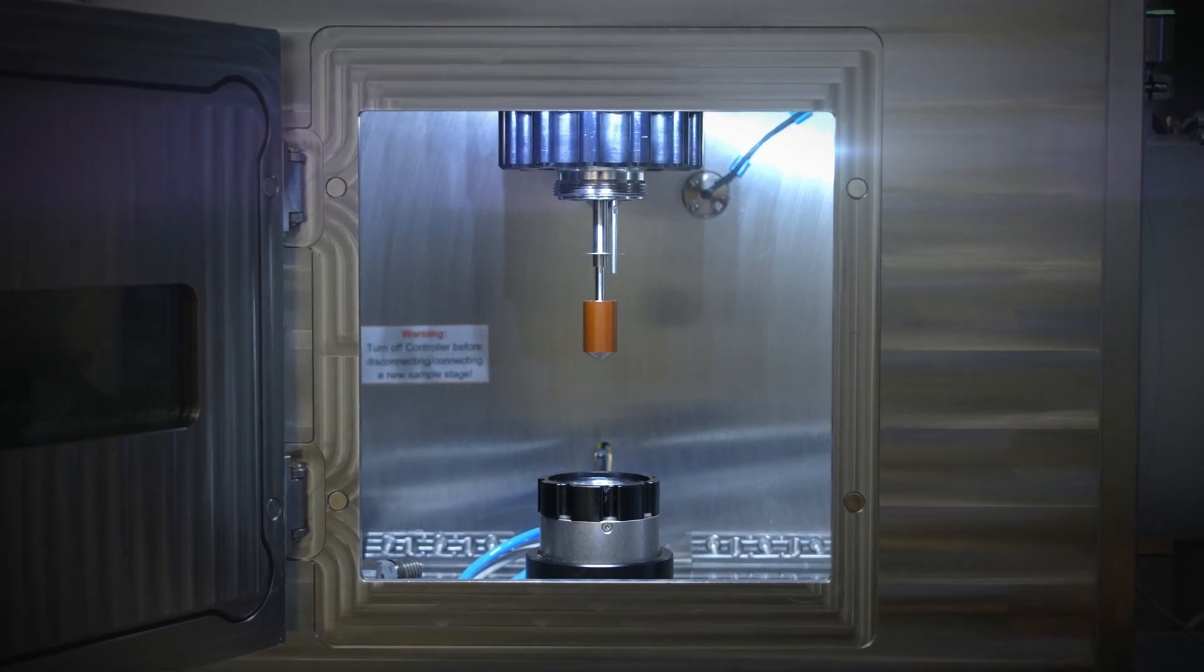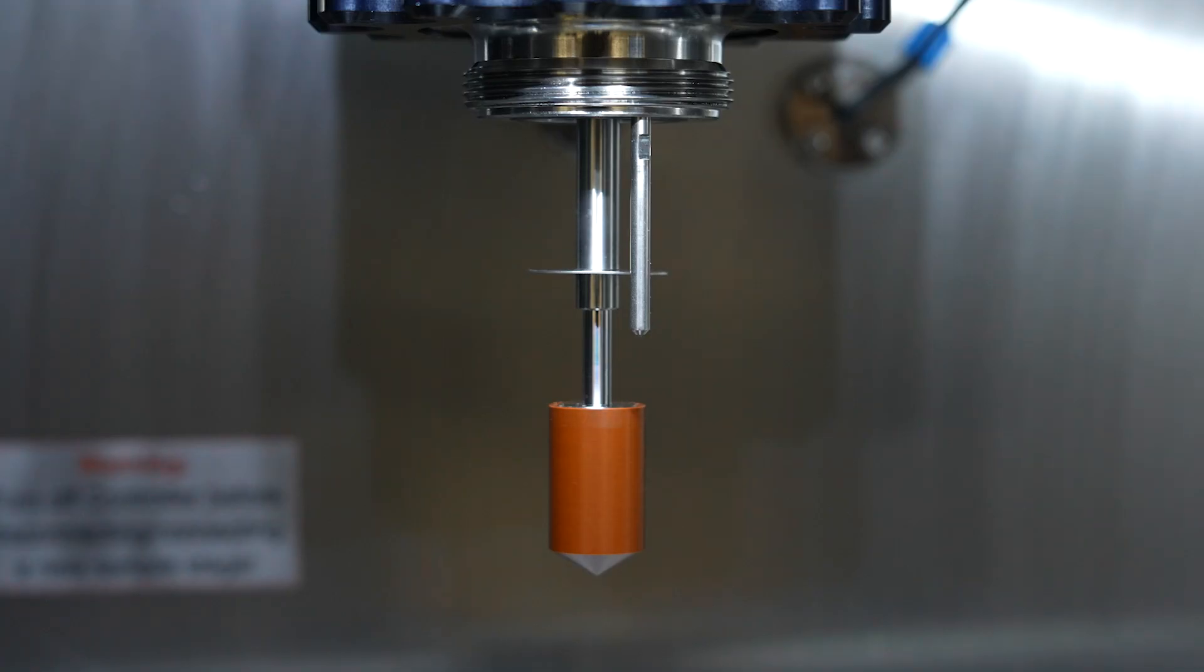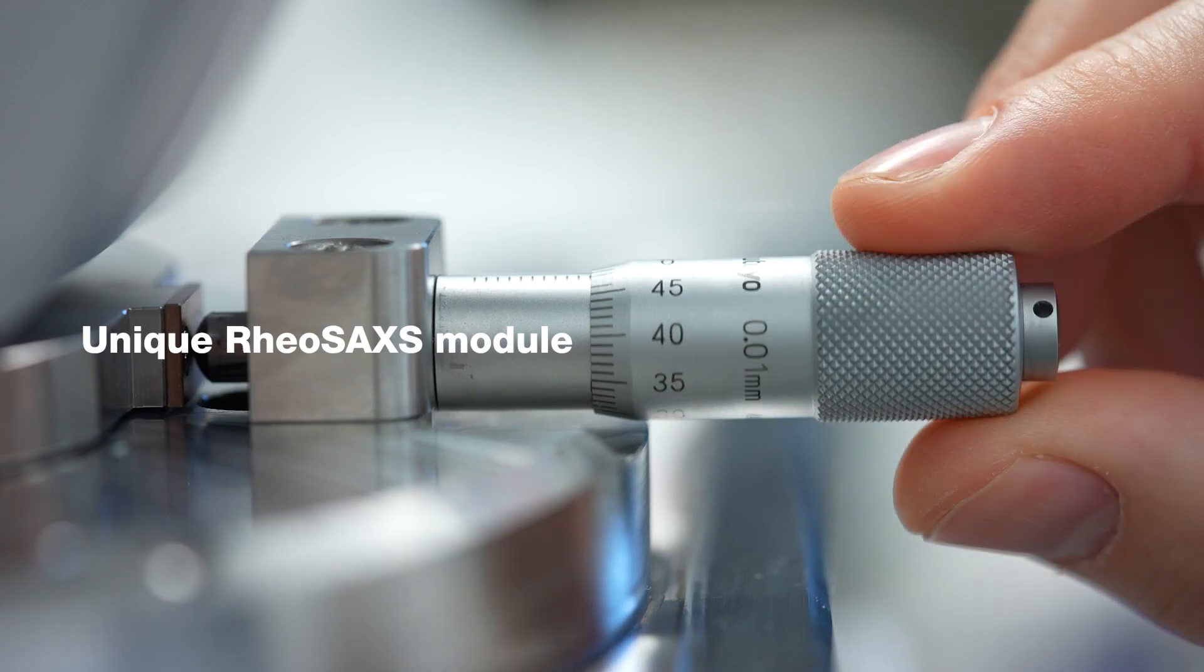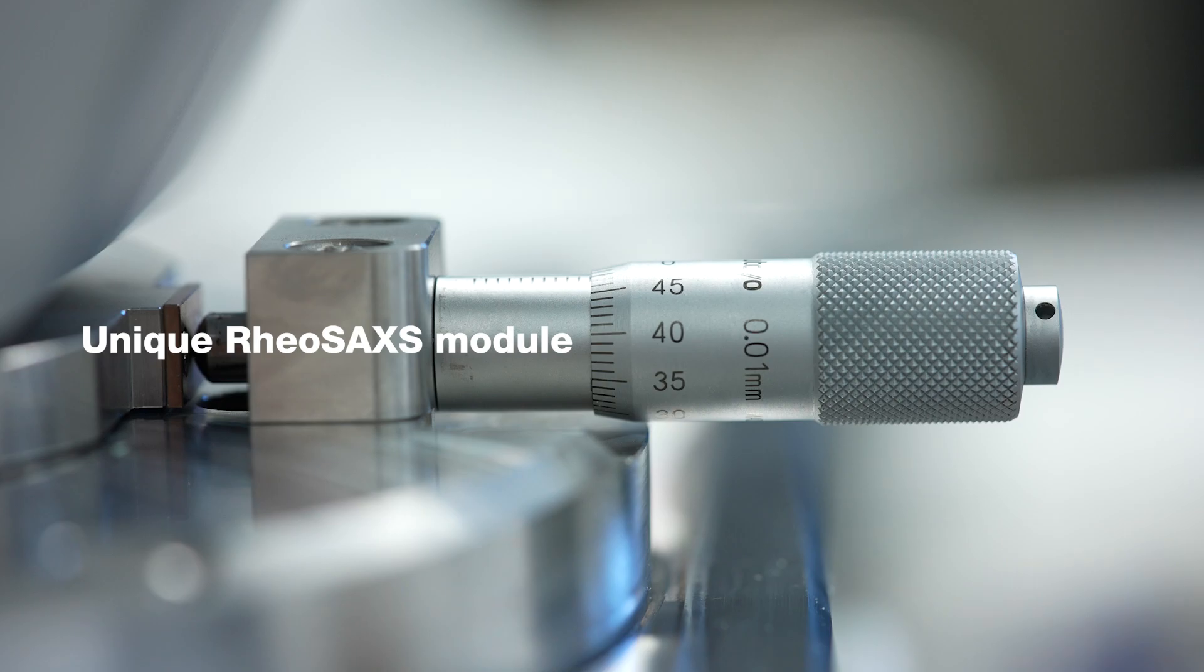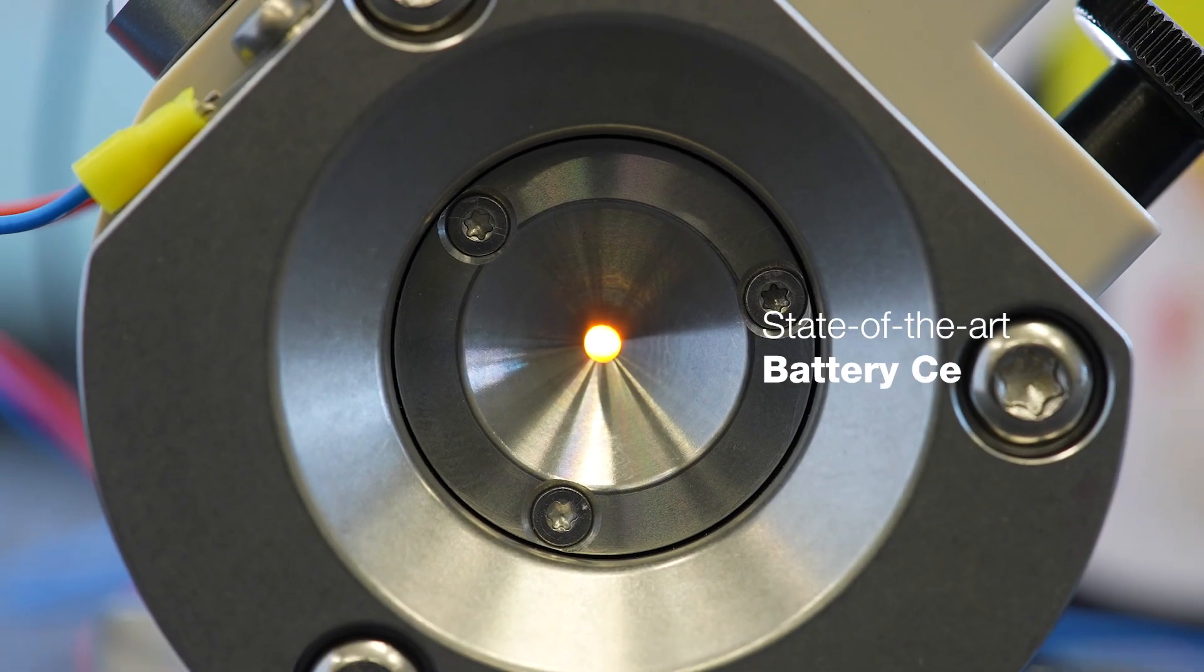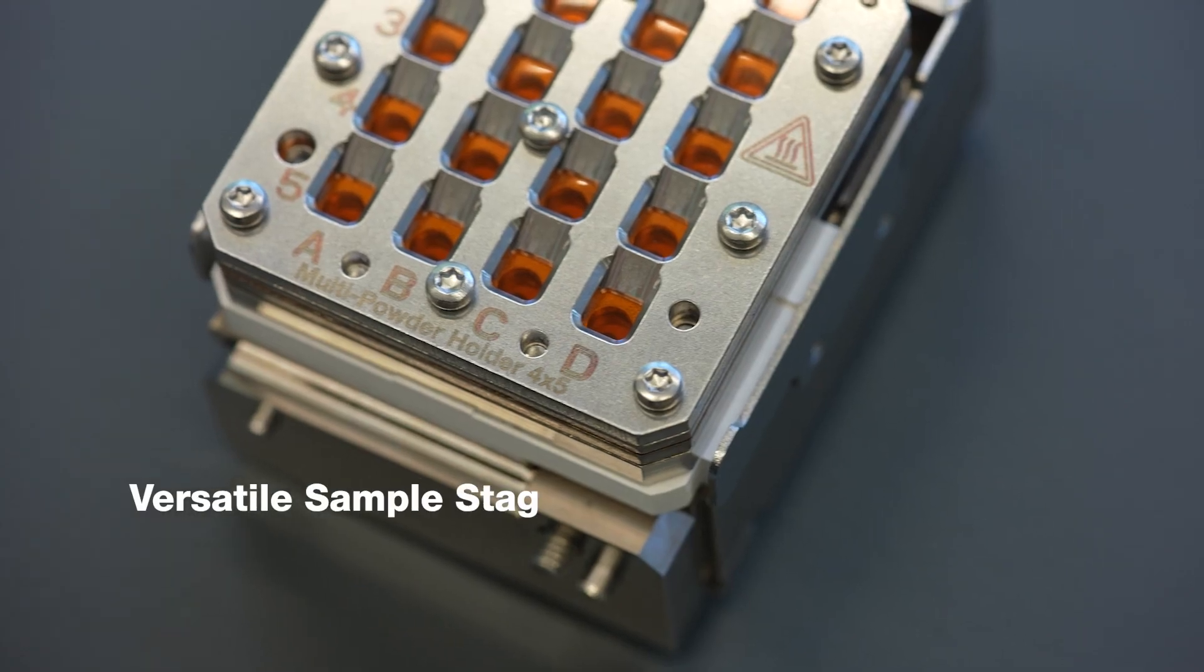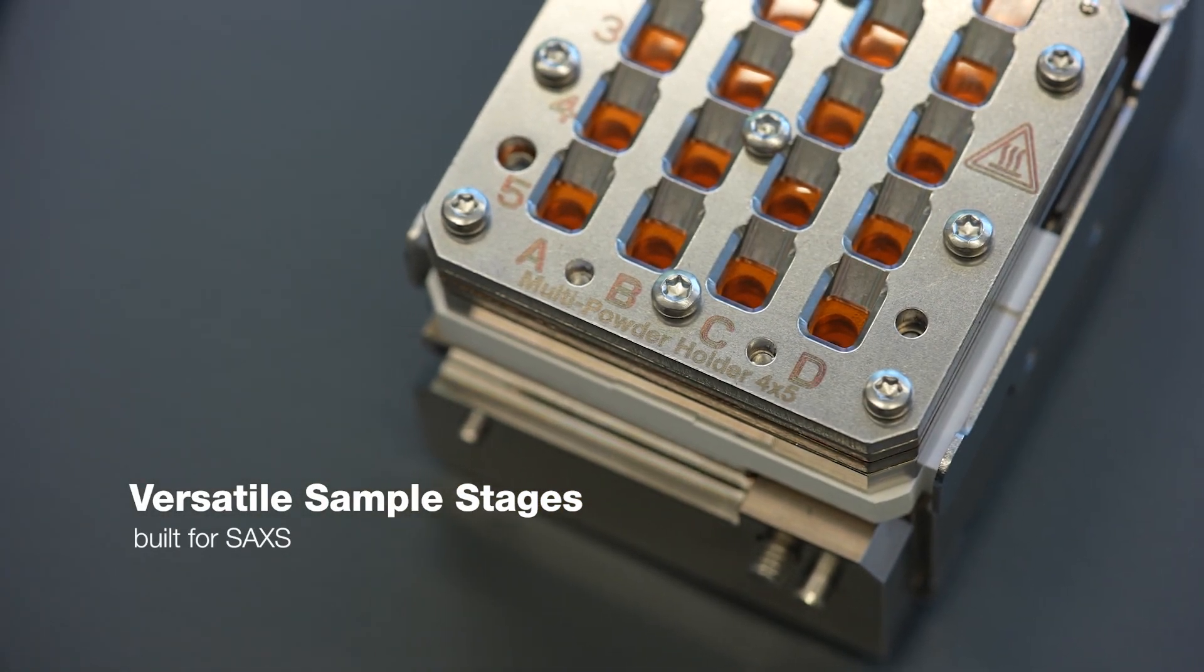Experimental flexibility is in our DNA. SAXSpoint 5.0 offers a unique Rheo SAXS module, a state-of-the-art battery cell. Next to our standard sample stage portfolio, we offer versatile, customized stages designed to match your specific experimental needs.